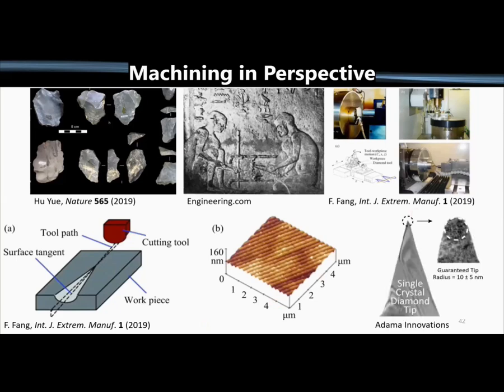And these days you can purchase single crystal diamond tips, much like the original diamond tip for the original AFM that was glued onto a gold foil and used with STM as the feedback mechanism for the first AFM.